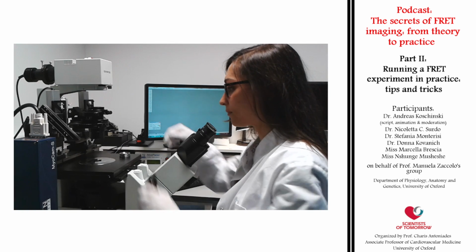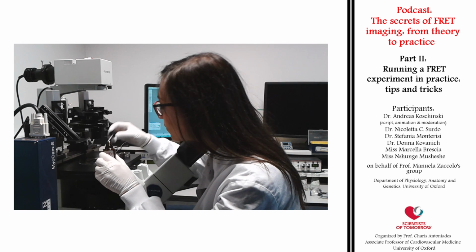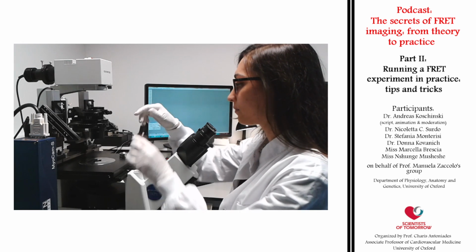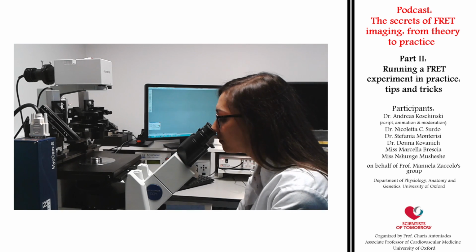Now Nicoletta will have to look for a suitable cell, do the initial adjustments I explained before, and then she will start the experiment. As this would take too long in real time, we have a time-lapse video of exactly this experiment.